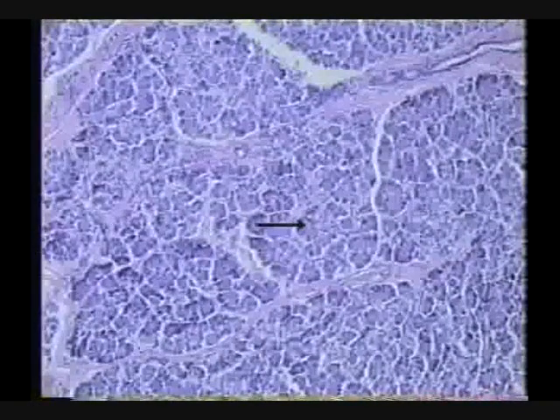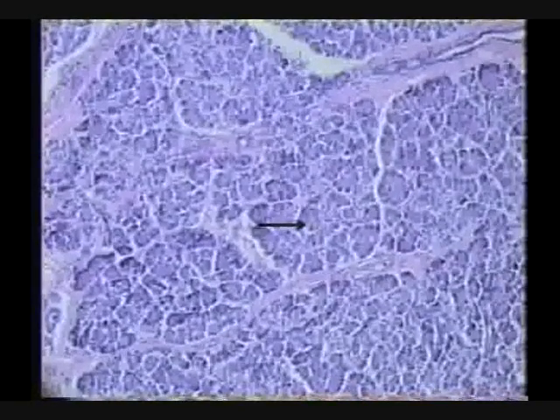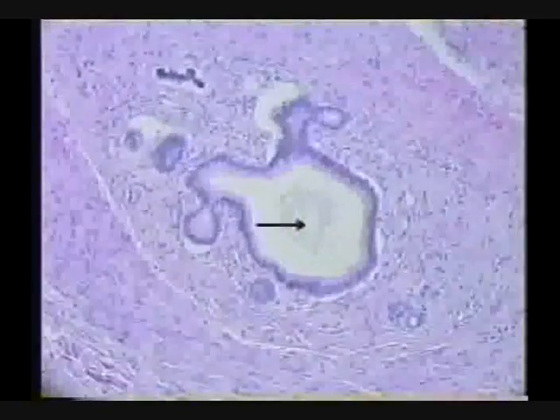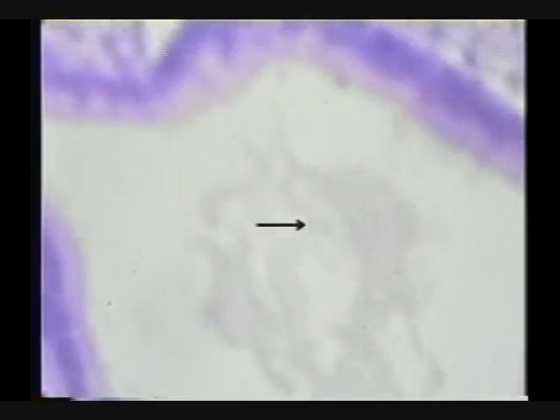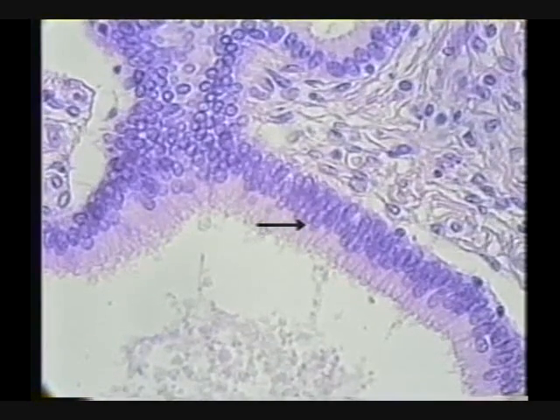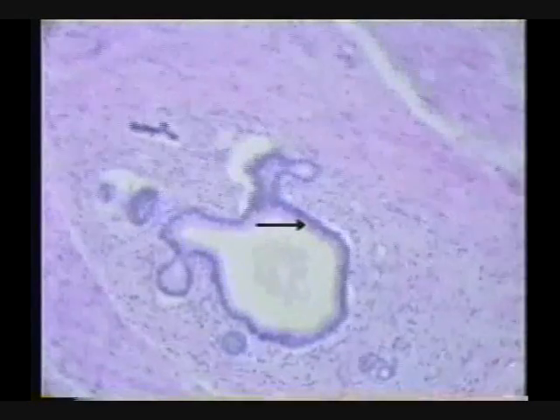Identify the organ in the field of view. Take your first shot. Pancreas. Yeah, I just happened to get in there and run into pancreas, which wasn't what I was looking for. There it is. What's that? That's a duct, isn't it? Okay. We look at that and we see that it has very nice, what kind of tissue? Columnar. That's beautiful, simple columnar epithelial tissue.